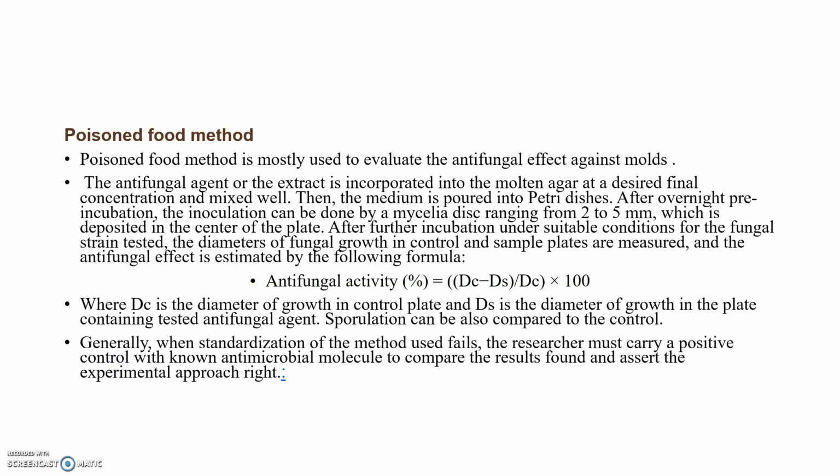Next method is the poison food method. The poison food method is mostly used to evaluate antifungal effect against molds.